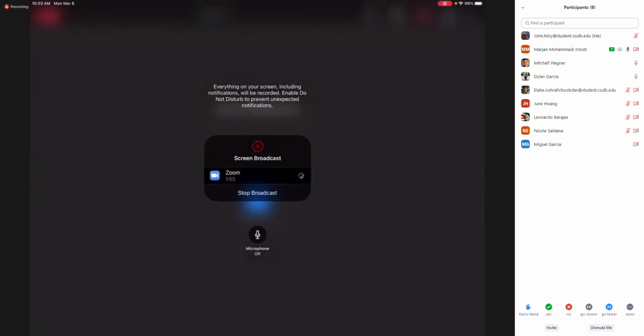You are in 451, guys. So make sure when you are giving this report to somebody that doesn't know anything about that report, they can understand what was happening there. So please make sure that you add to whatever you are getting from the manual, if it's necessary.